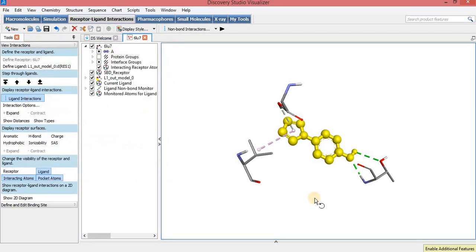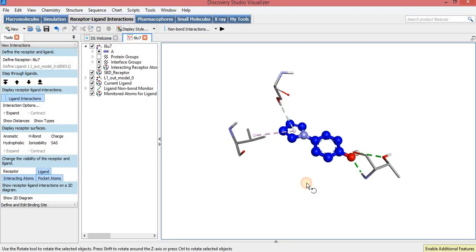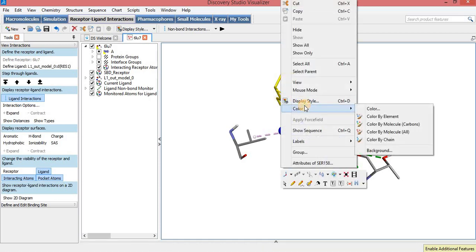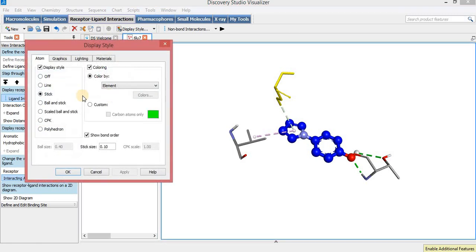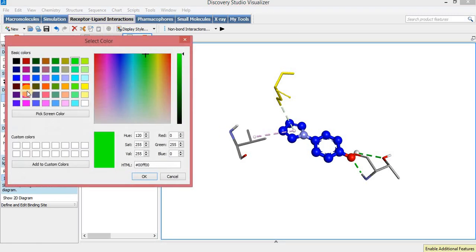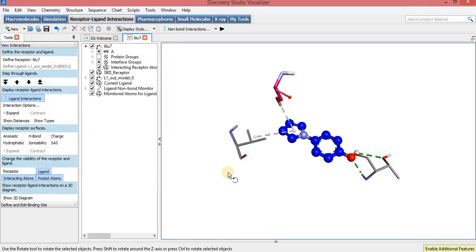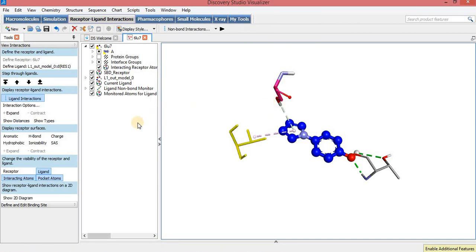In the same way, you can also change the amino acid residue colors. Just select it, right-click, and go to Display Style. I will select pink color for the amino acid residue and change the stick size from 0.10 to 0.15. In the same way, the color of other amino acid residues can also be changed.